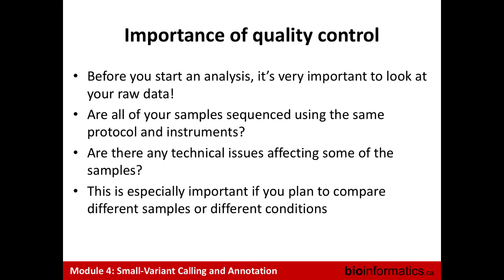Why is it important to have good quality control? Because if you want to compare samples, you need a good quality of your samples. Otherwise, one with lower quality will have technical and artificial variants that will appear. So it's really good that all of your samples are good quality, but also that all of your samples come from the same protocol and the same instrument. It's really, really important to think about that when you do this.